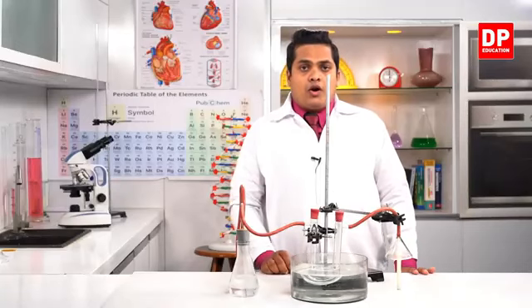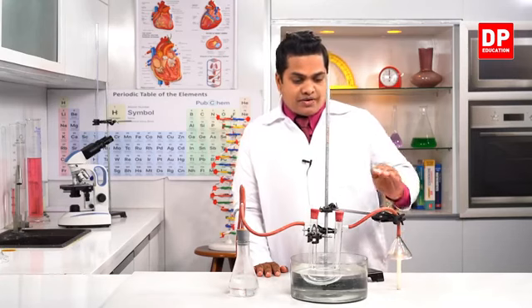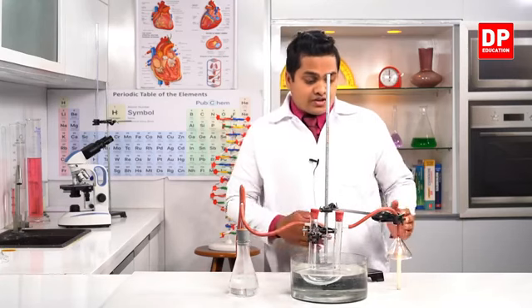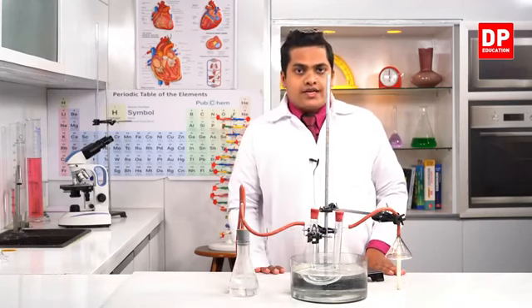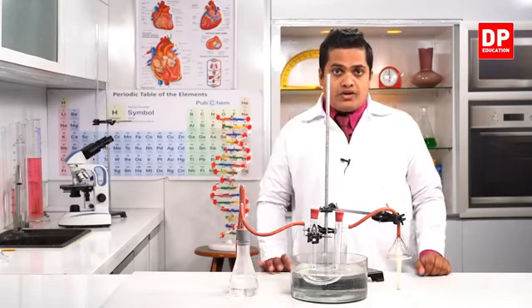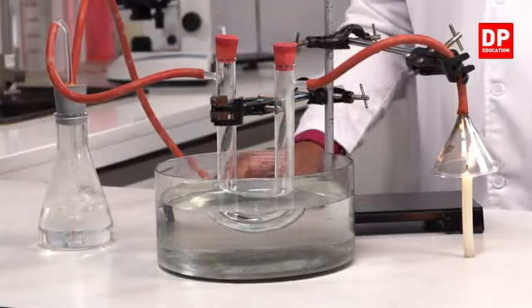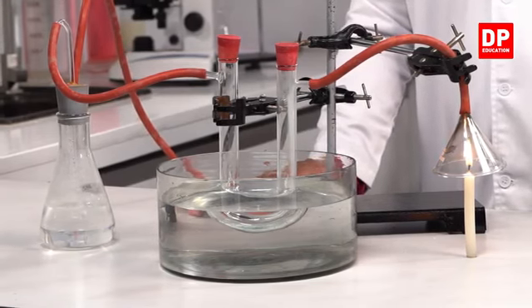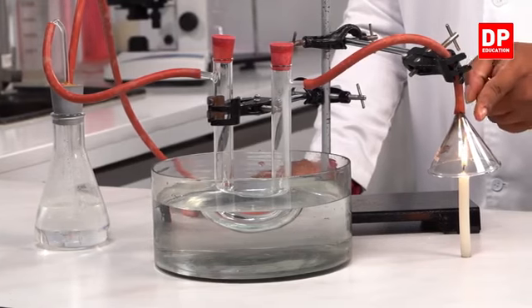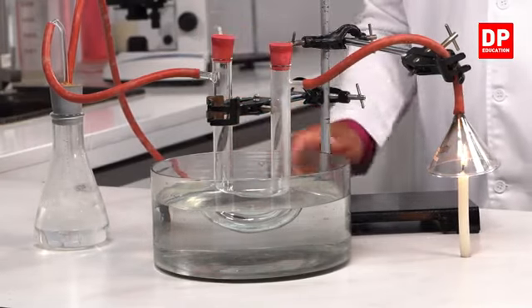So we'll operate the aspirator and keep the candle flame somewhat steady so that the smoke coming out from the candle goes towards the system on my right hand side. Right, so we'll operate the aspirator then. Here you can see that the aspirator is working now. So the candle flame or the product which is getting created is coming towards the anhydrous copper sulfate crystals. You can see it.